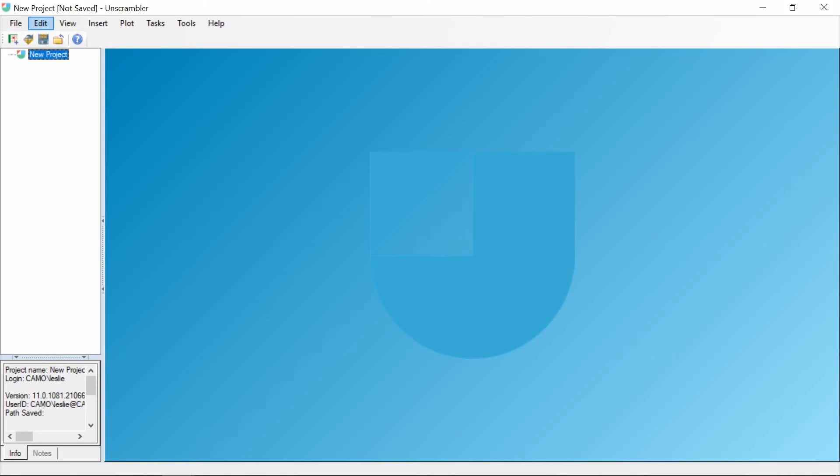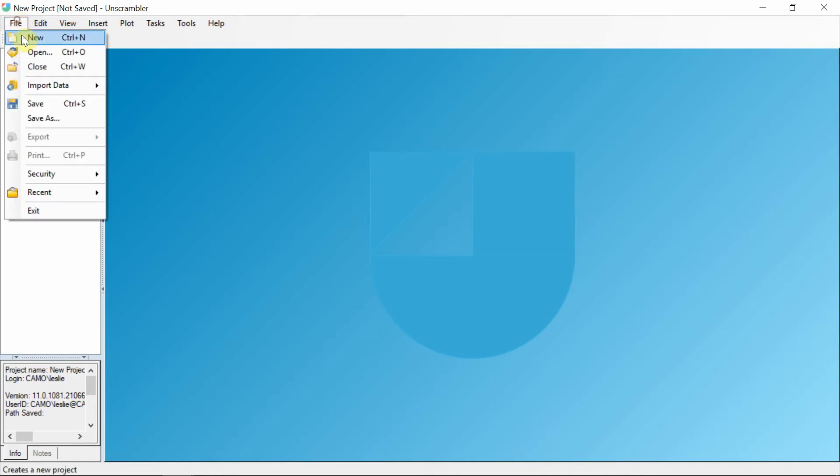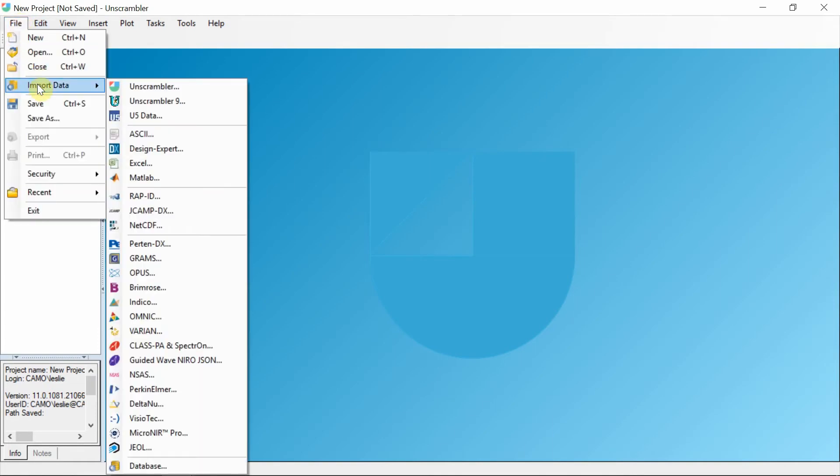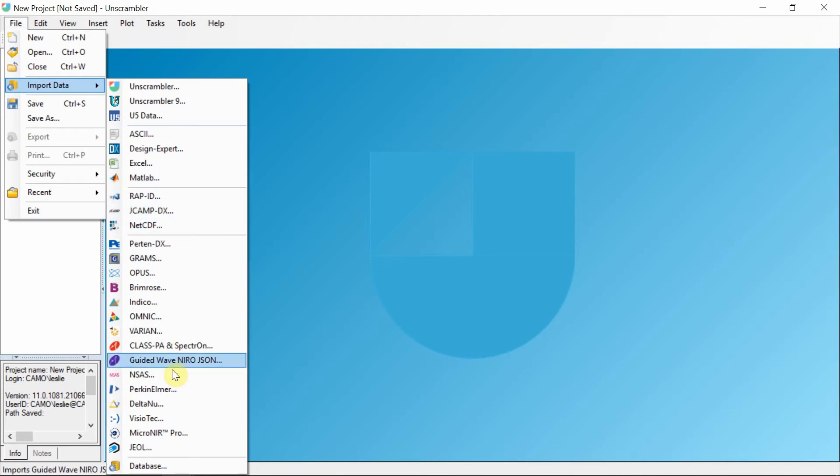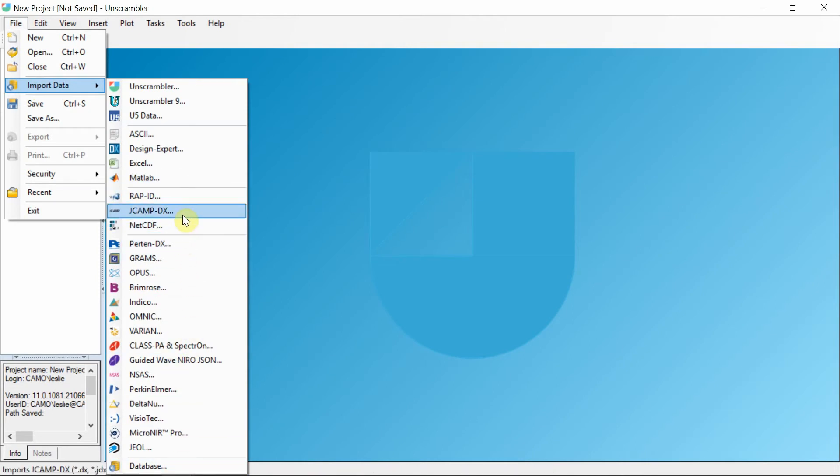So you downloaded and installed Unscrambler to analyze your spectral data. Now what? From the import menu, you can directly import generic spectral formats and spectral proprietary formats.